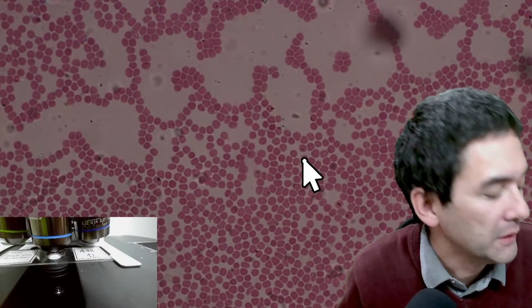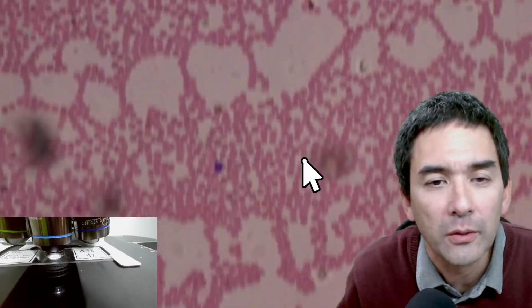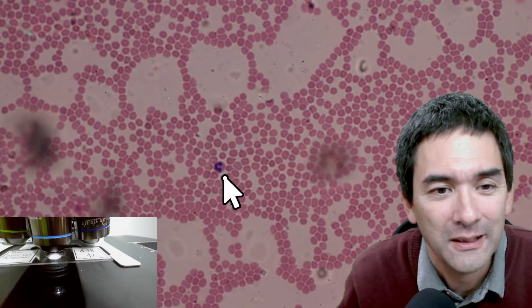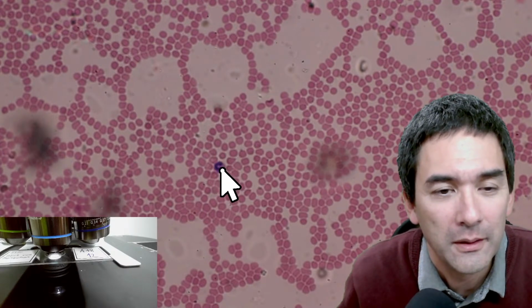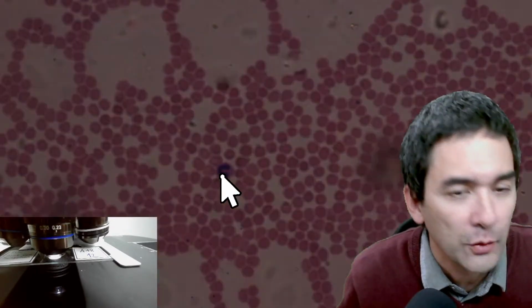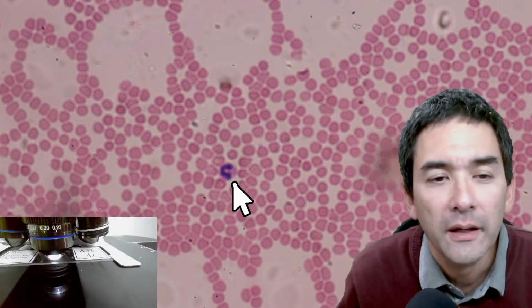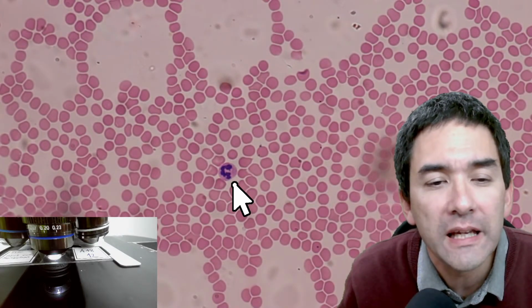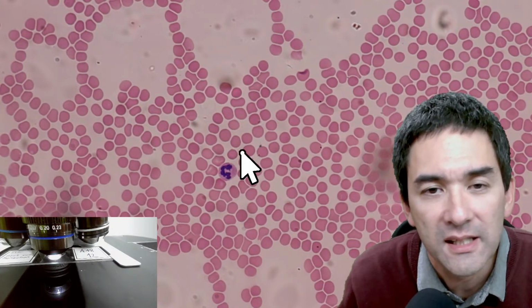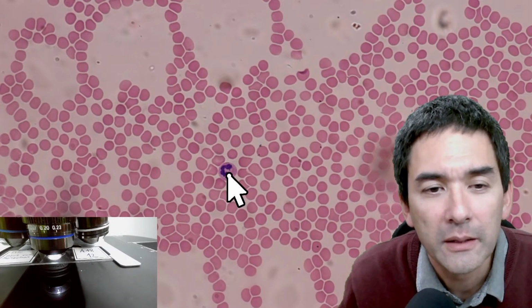because you can actually see the flexibility of the red blood cells. I did some staining with methylene blue. I was able to see white blood cells. Here's a white blood cell. That's this one here. You see, this is very typical. The dark blue stain is the nucleus, and white blood cells have a lobed nucleus. By the shape of the nucleus, you're even able to categorize it. Now, I don't know which one it is, but this must be a stained sample. Yeah, so this is a white blood cell.